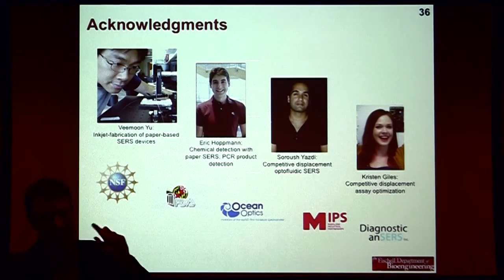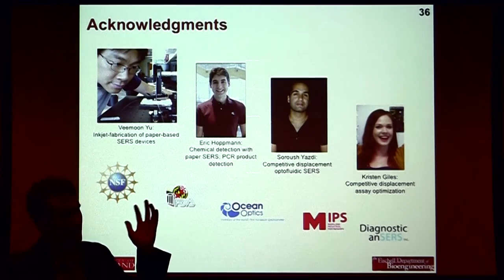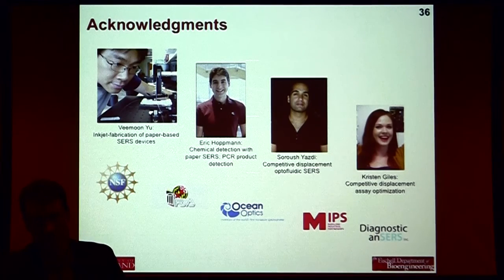So you find a different and, importantly, simpler way to do it. And I think the other thing that's really helped us out is really thinking about everything as a system and not a device. I worked as a postdoc for 3 years engineering sensors, and our focus was on the sensor. And we tried to say they were practical sensors, of course, and better than other sensors, but in reality, we ignored the system and the difficulties it takes to get the sample to the sensor.